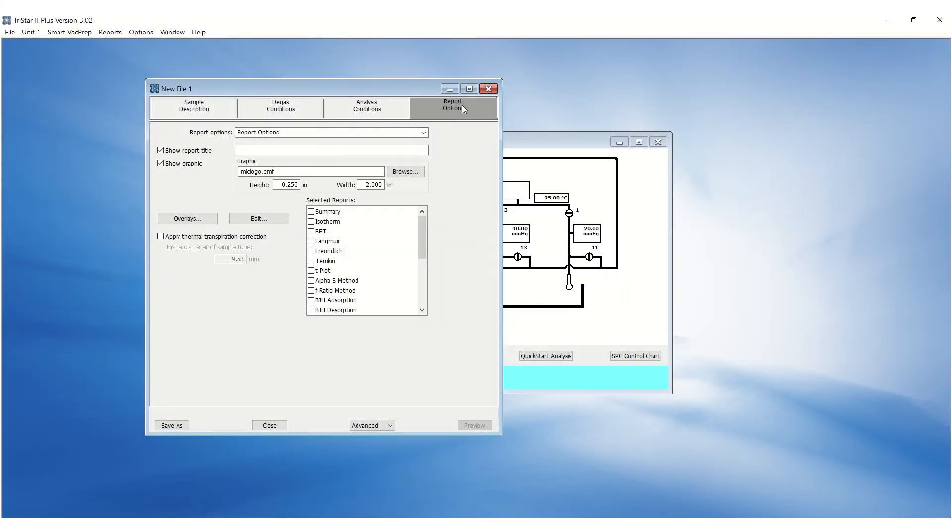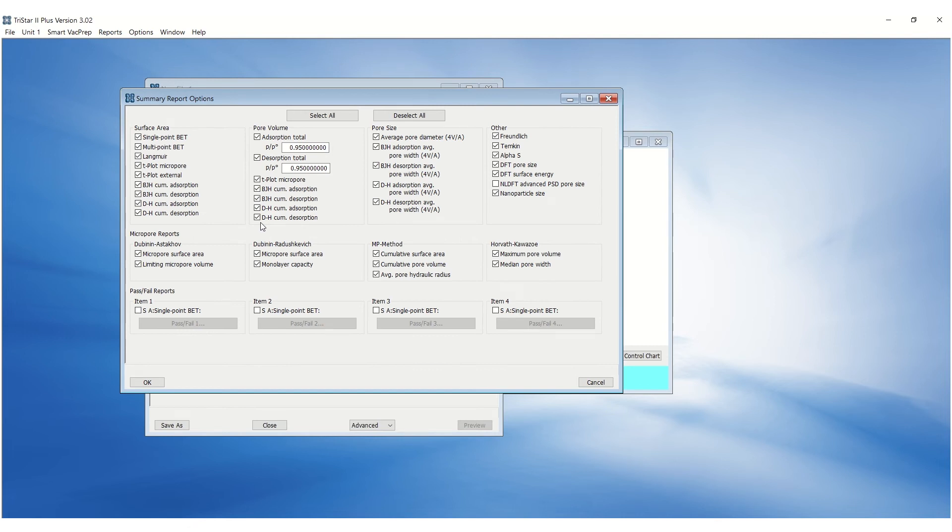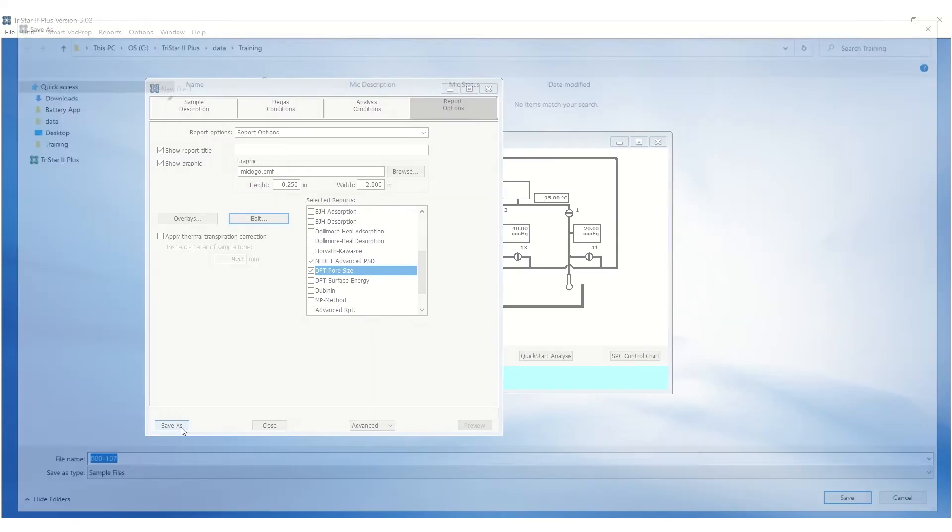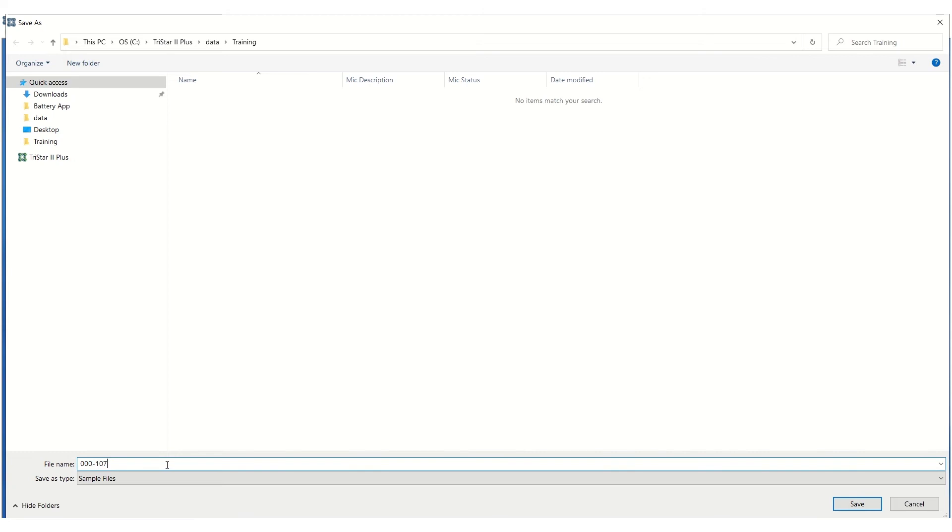Reports can be selected in the reports tab. Check and highlight Summary and click Edit. Deselect all and check DFT Pore Size and NLDFT Advanced Pore Size. Click OK to save. Also select Isotherm, NLDFT Advanced PSD and DFT Pore Size. After creating a sample file, click Save As, enter the desired name, and Save.